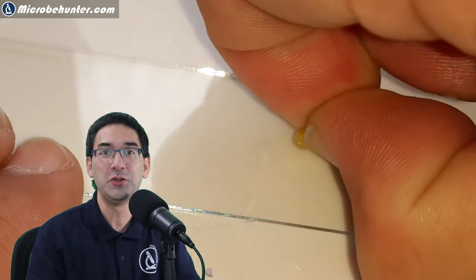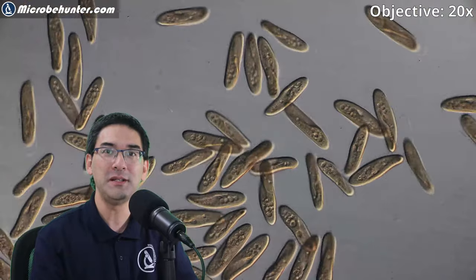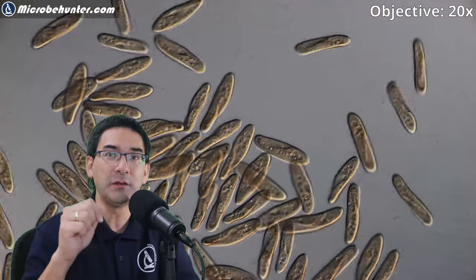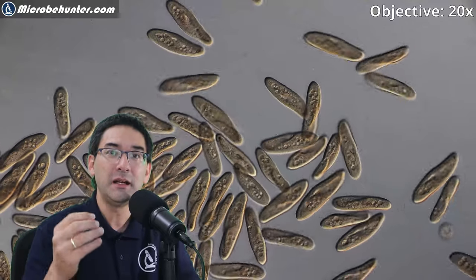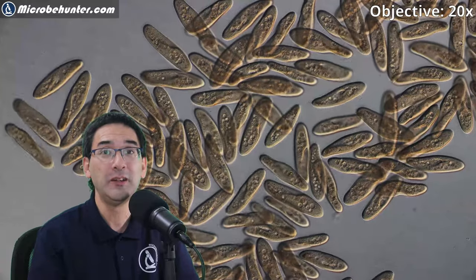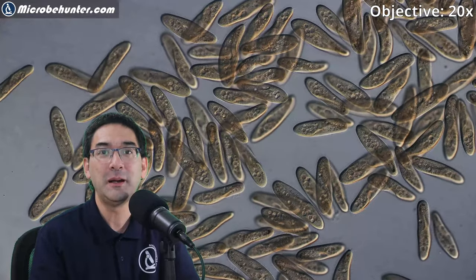I tried to dilute it a little bit and tried different concentrations, and discovered that depending on the concentration the paramecia behave differently. You can see that very few of them are actually resting — almost all are moving around. But when I added a little bit of this capsaicin-containing sap, it slowly started to diffuse beneath the cover glass — and then look what happens: they stopped moving.